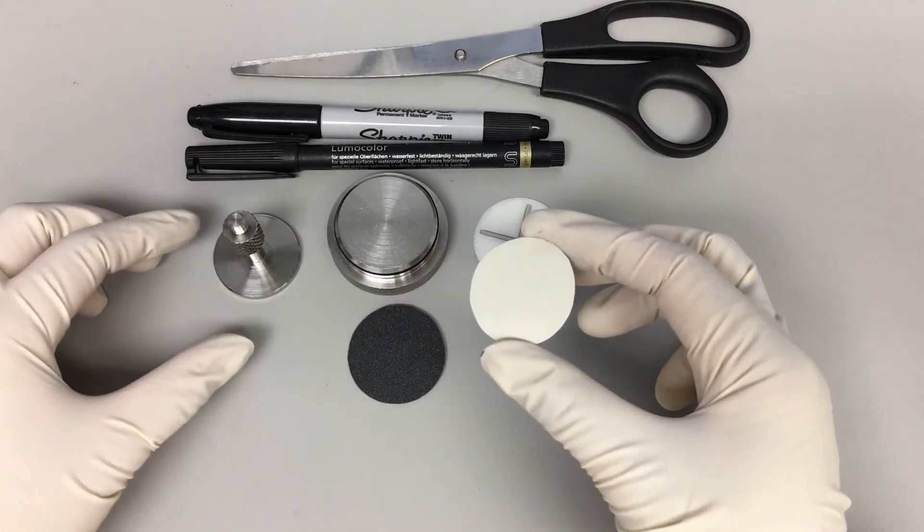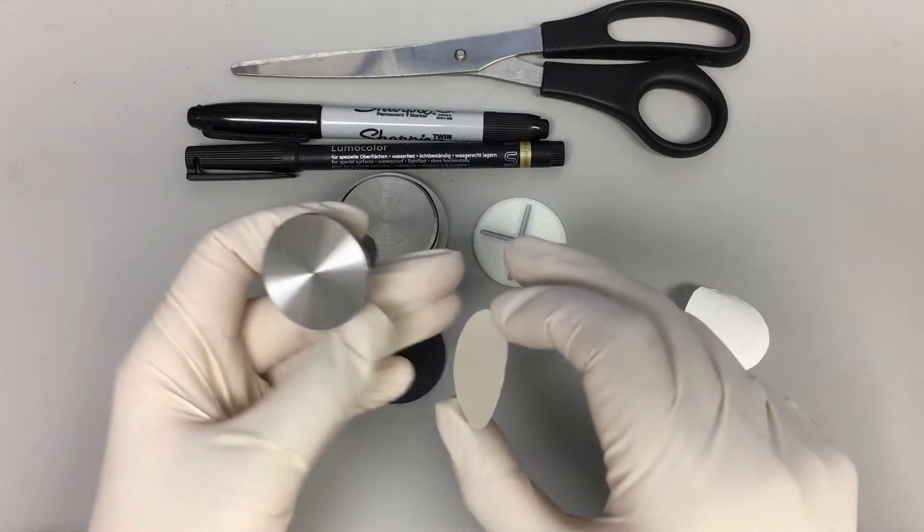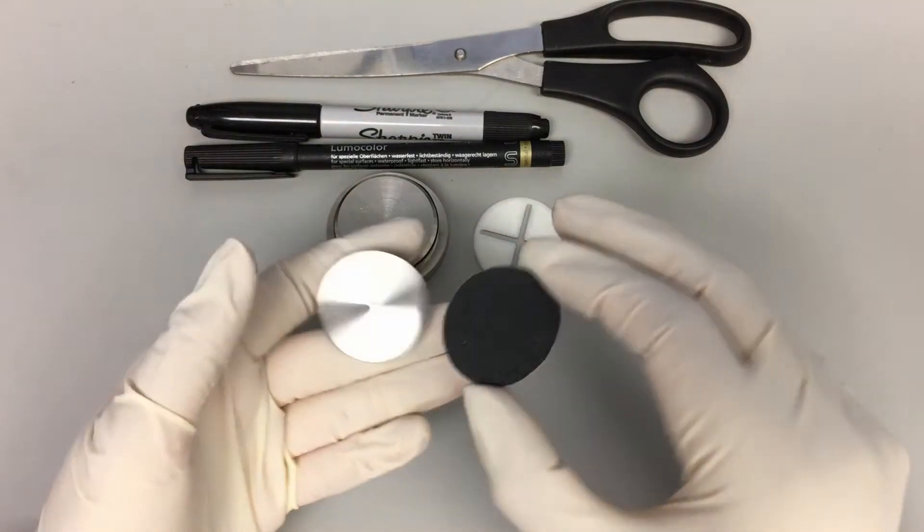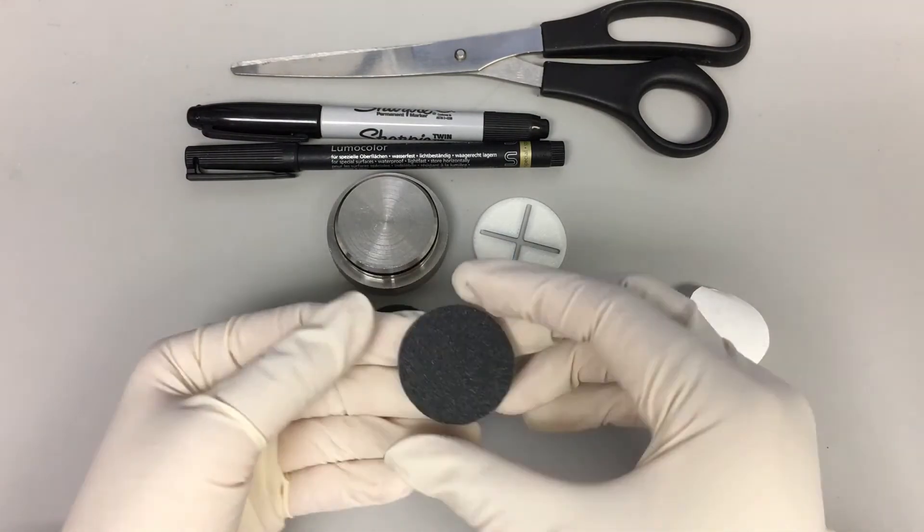Carefully stick each piece of adhesive sandpaper such that it neatly fits the entire surface of the platen and the sample holder. Apply pressure for a moment to ensure proper adhesion.